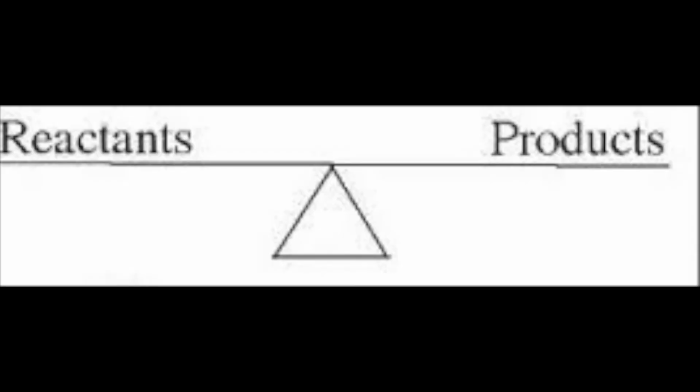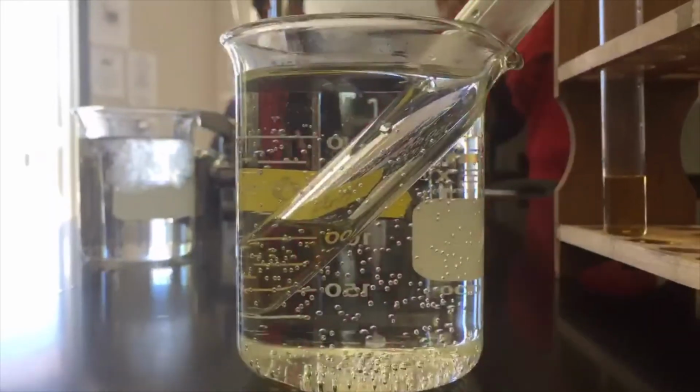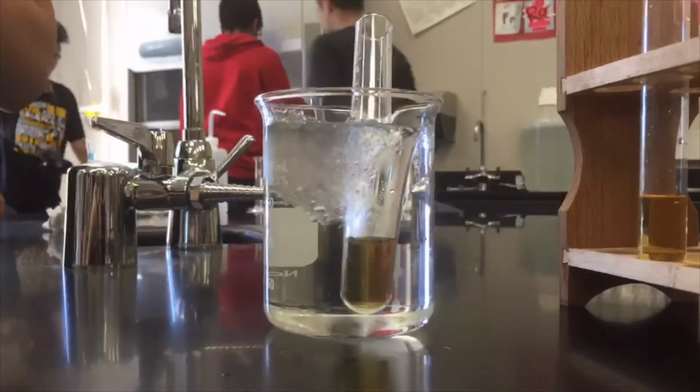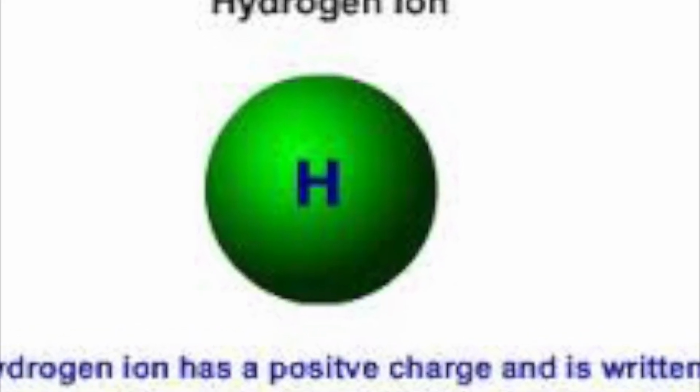In this lab, we gained a deeper understanding of equilibrium and Le Chatelier's principle. To do so, we changed the conditions of a system in order to observe the effects. The conditions that we changed were temperature, pressure, and concentration of H+ from the product side.